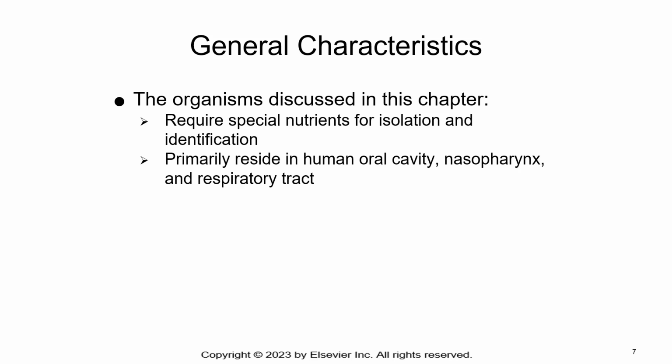As we go through here, we're going to look at several samples of prepared slides, and you'll see how, because they're gram negative, they're super tiny, they kind of blend in with debris found in the background of the slides. A lot of times these can go unnoticed.